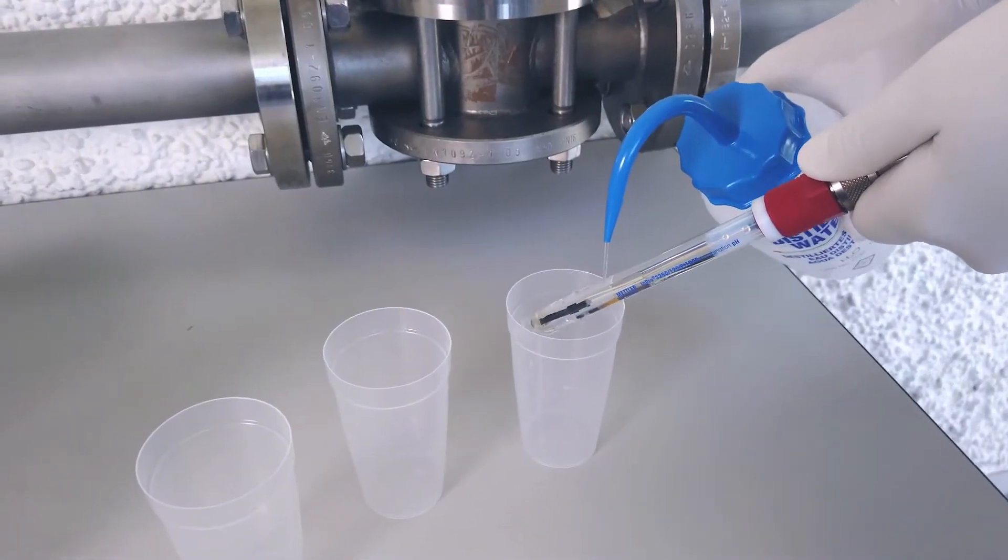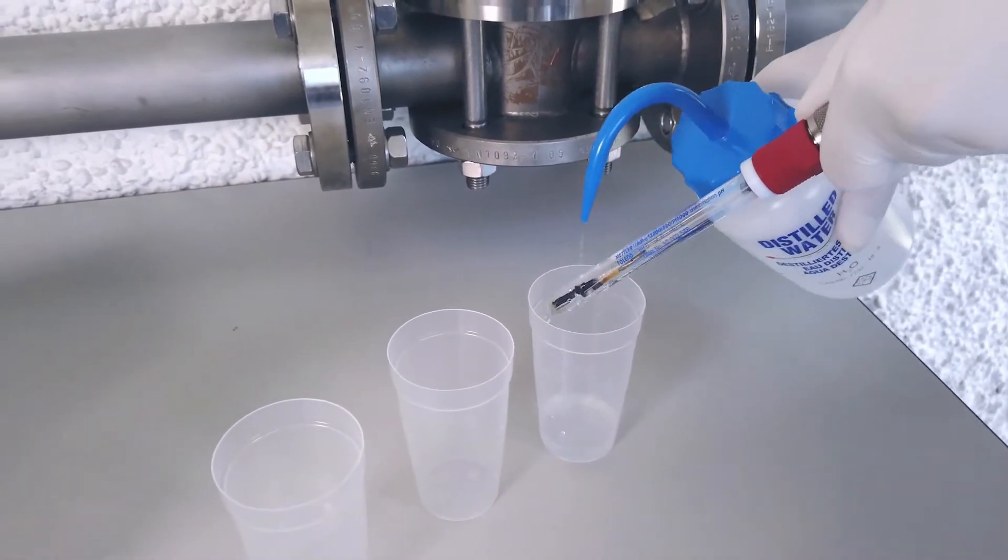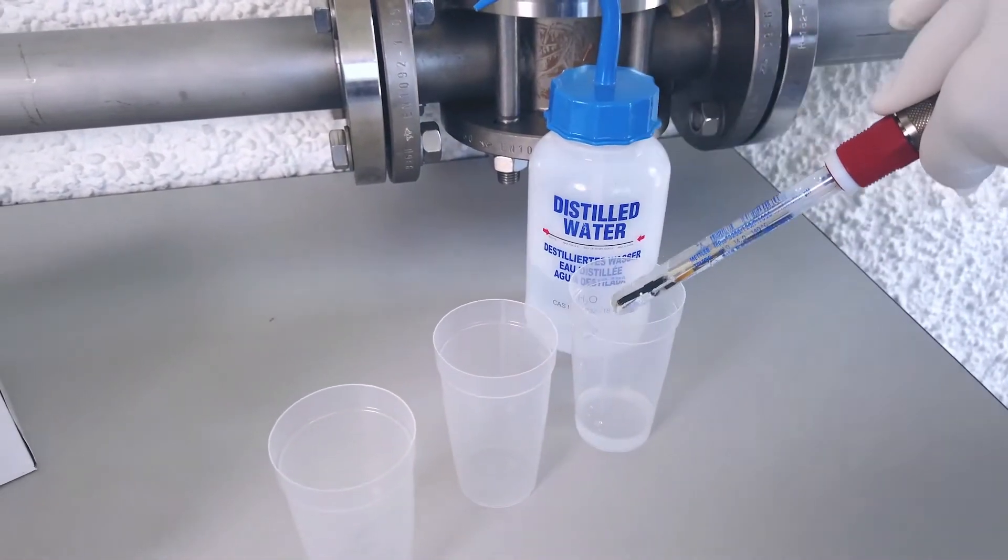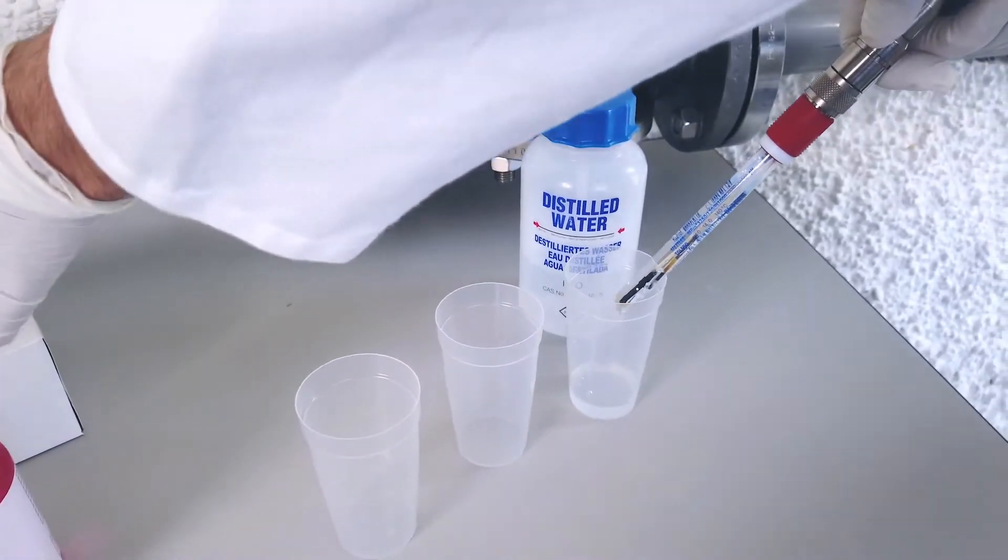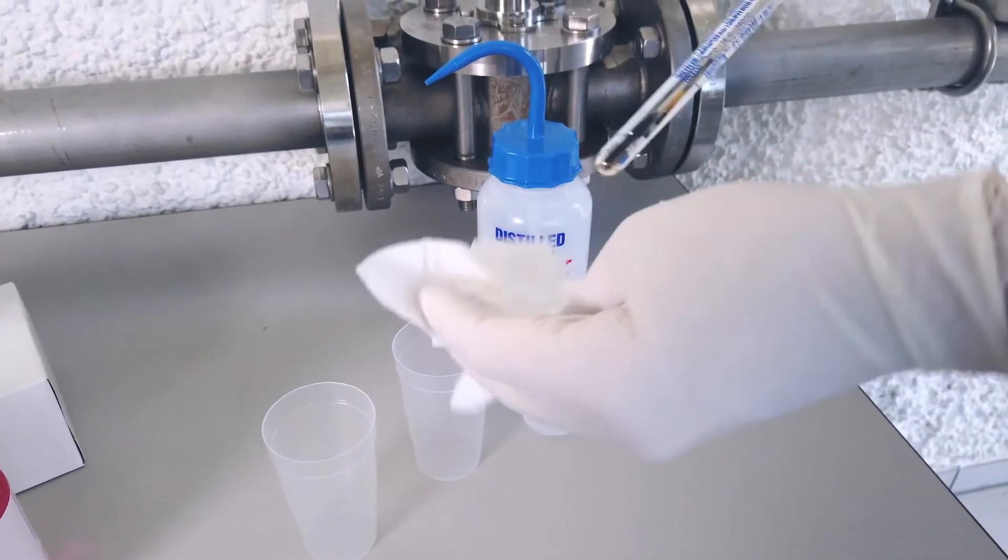Before you start to calibrate, you need to rinse the sensor with distilled water in order to remove any possible contamination, then dry it. Don't rub the sensor, but gently pat it dry. Rubbing can induce an electrostatic charge which can affect the measurement.